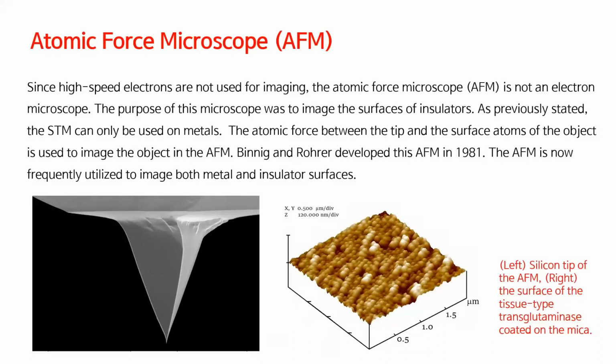Now let's see the atomic force microscope, AFM. Since high-speed electrons are not used for imaging in the AFM, the atomic force microscope is not an electron microscope.